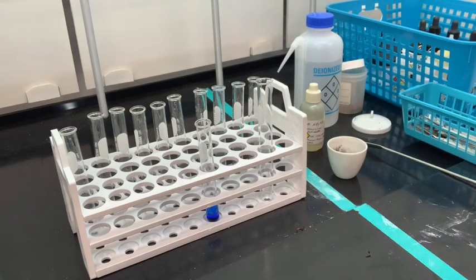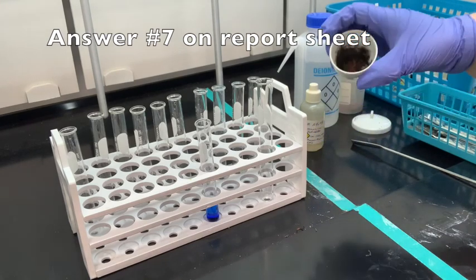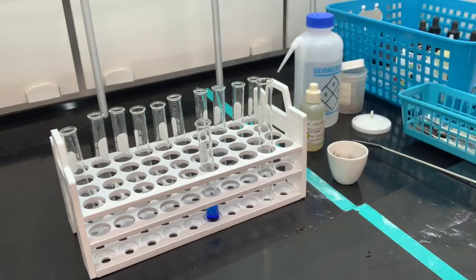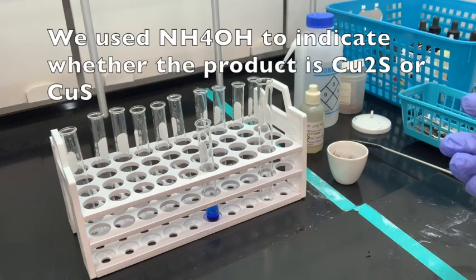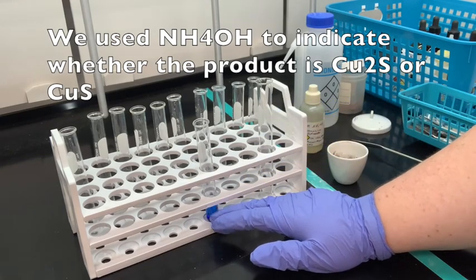And then number 7 is to write the reaction between copper and sulfur to make whatever this copper sulfide compound is. You are not going to write anything that involves ammonia. We just use the ammonia to tell us whether this was copper 1 sulfide or copper 2 sulfide.